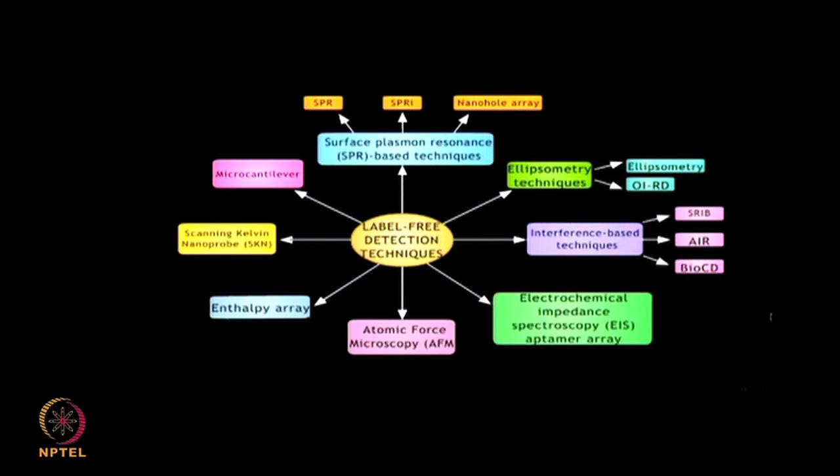Microcantilevers, these are thin silicon based gold coated surfaces that hang from a solid support. Bending of cantilever due to surface adsorption is detected either electrically by metal oxide semiconductor field effect transistors or optically by changes in angle of reflection.